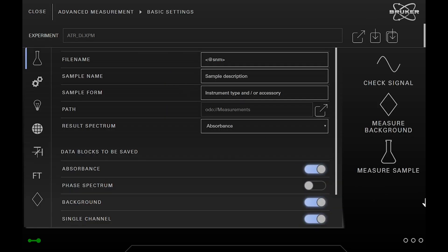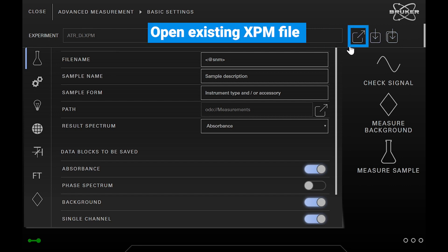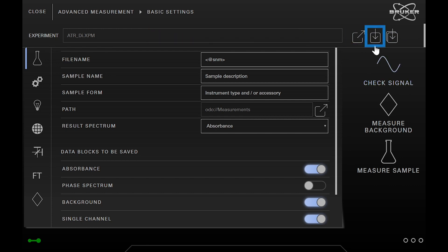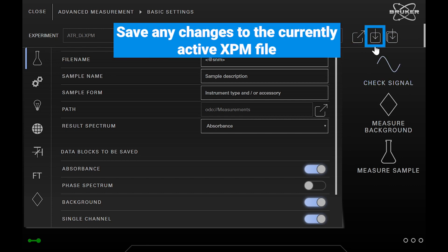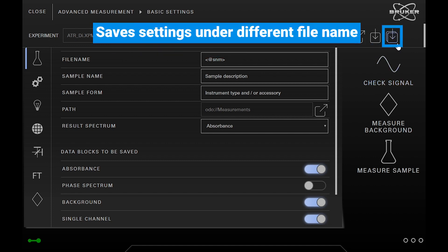In the upper text field you can see the name of the currently loaded settings file. To the right there are three buttons. The one on the left allows you to open an existing XPM file. The button in the middle saves back any changes to the currently active XPM file. And the one on the right allows you to save the settings under a different file name.